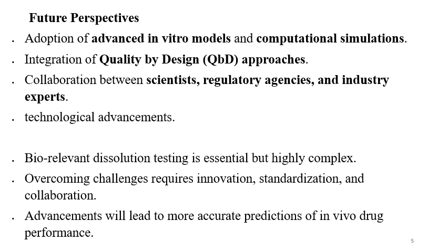So, in conclusion, we can say that biorelevant dissolution testing is essential, but it is a highly complex process. Overcoming challenges requires innovation, standardization, and collaboration. Advances will lead to more accurate predictions of in vivo drug and formulation performance.